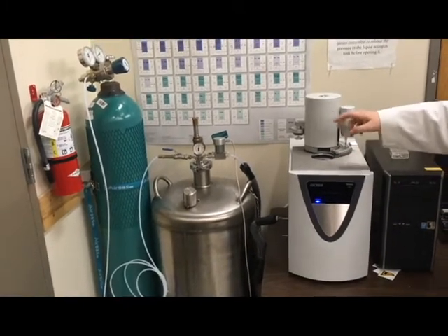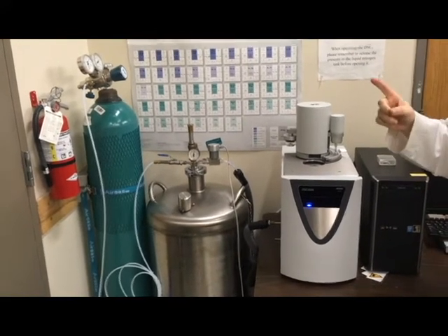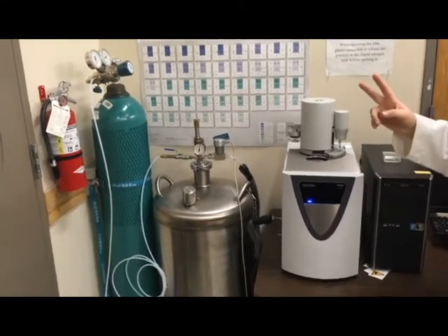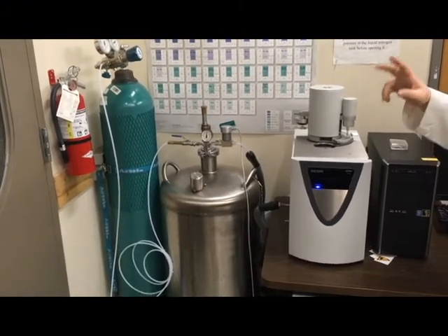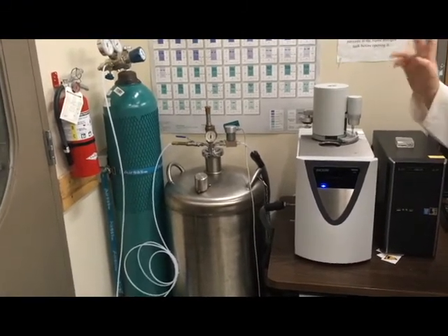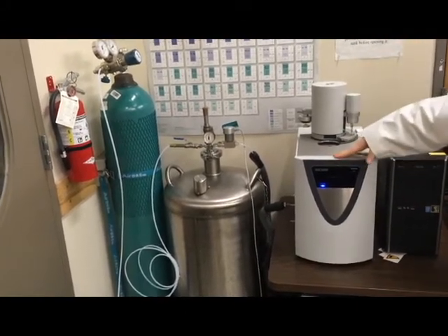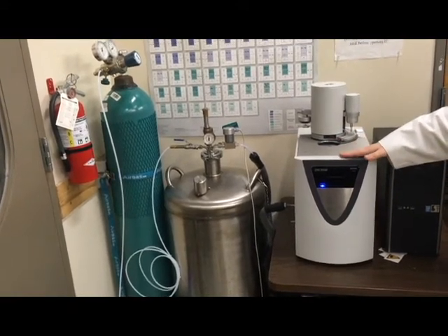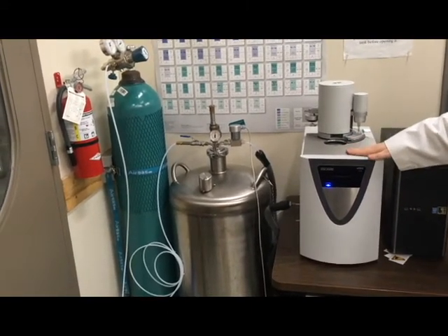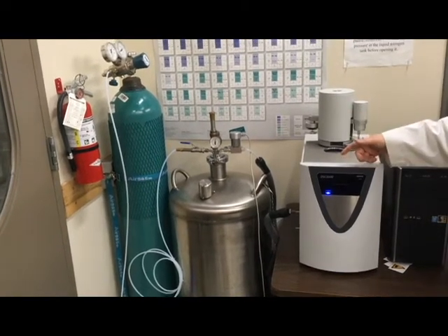Inside you've got two spots for a sample. You've got space for a reference crucible, which is usually empty, and a sample crucible, which is usually full — unless you are running a correction scan, also called a baseline, in which case you have two empties next to each other. The DFC needs at least one hour to warm up, which allows the electronics to come to a nice equilibrium, at which point you're allowed to start running your scans.